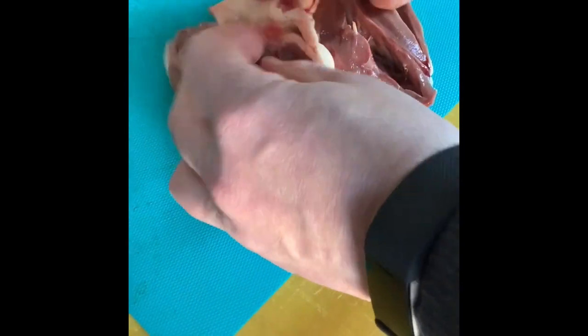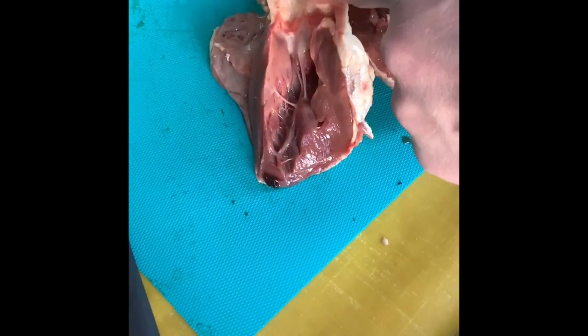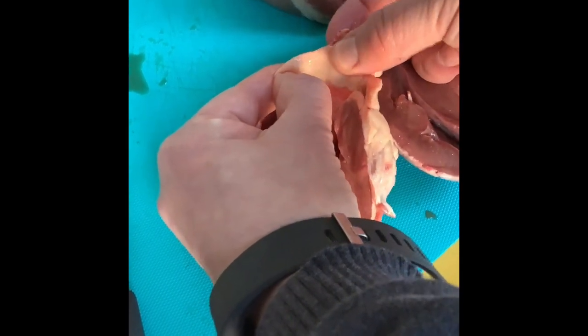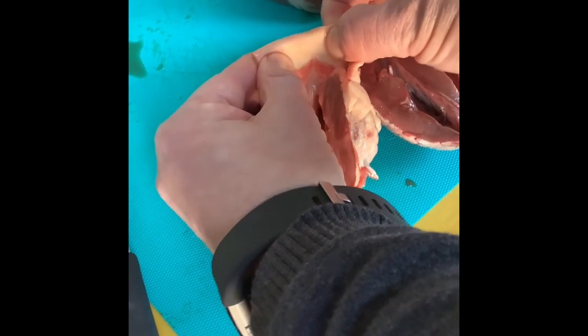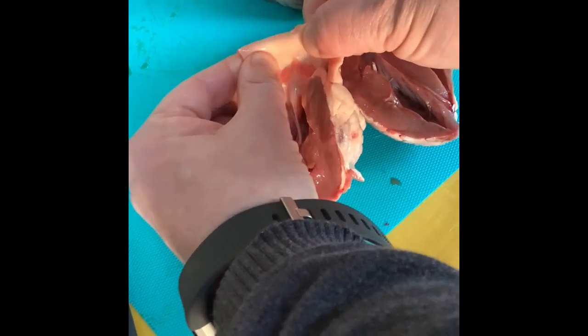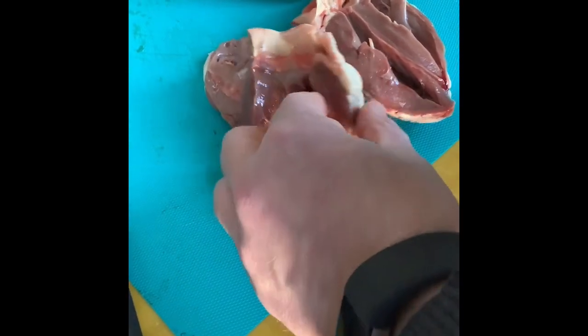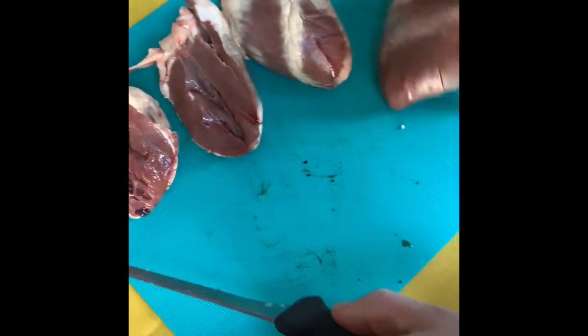I've cut through this blood vessel here, which is actually the aorta. You can see it's not muscly — it's really just elastic. The blood is under such high pressure that the aorta has to stretch and then recoil with each heartbeat.